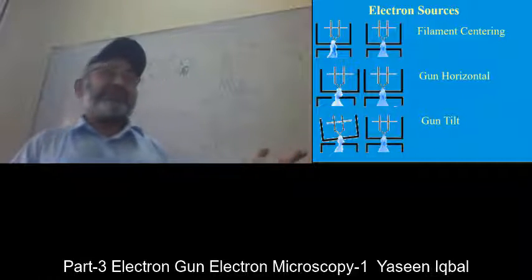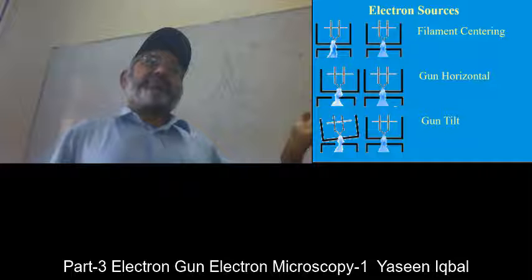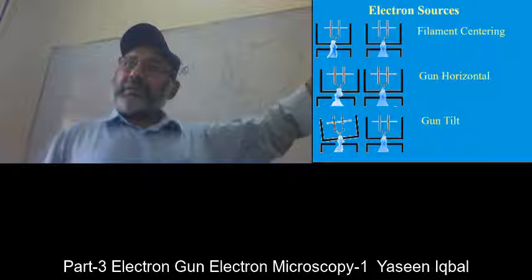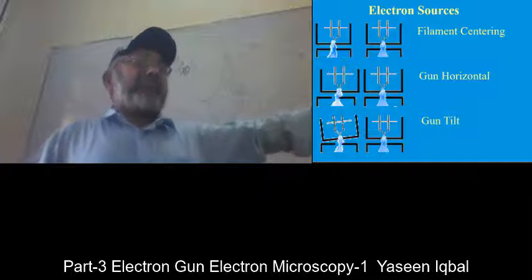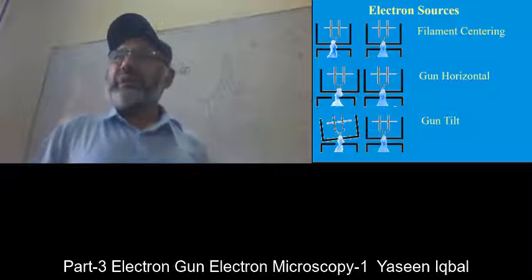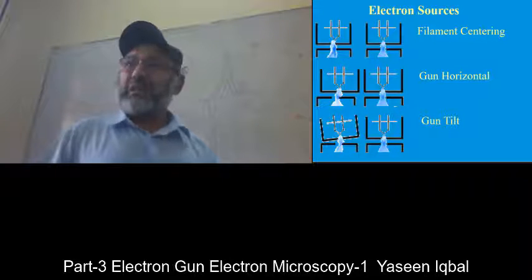The price of the microscope you have here, depending upon the age of the microscope, is from 50 million rupees to 100 million rupees. And these are the common microscopes, not any specialized microscopes. When I was studying in Cambridge, a room was being built for a microscope and it cost more than 1 million pounds, just the room for the microscope.